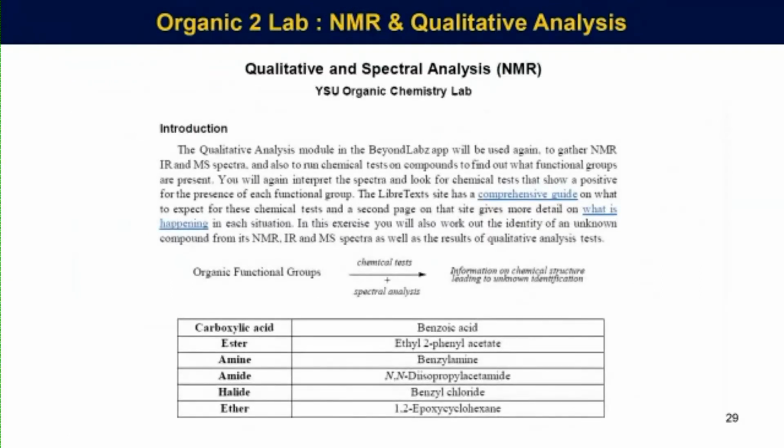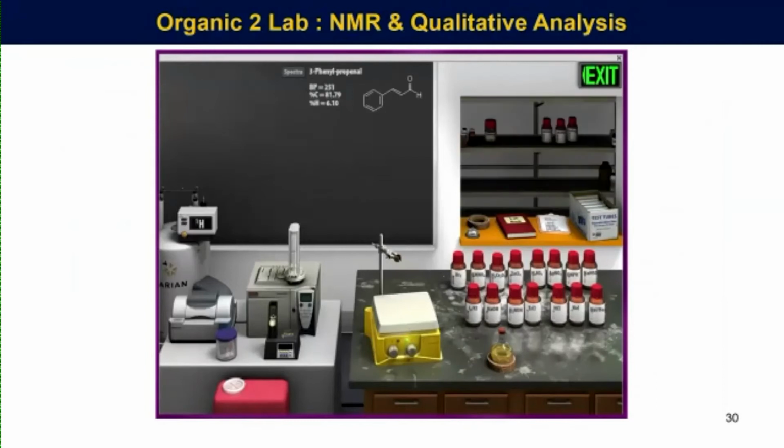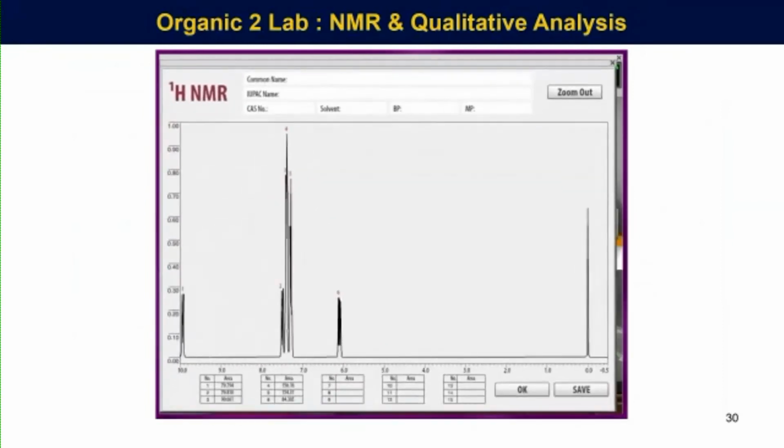NMR, again, we're spoiled. We have 2 400 megahertz NMR spectrometers at my fingertips at work, but we need to give the students historical perspective. And we chose a bunch of different samples to play with, and they did the functional group tests again, and then they went ahead and did the spectra. So this is just cinnamaldehyde. You know, it's full of wonderful signals, doublets and what have you. Using the NMR spectrometer in this situation with the qualitative analysis was great because it was simplified.